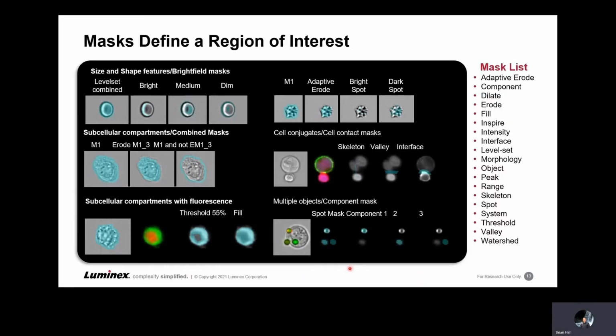The next step is to look at nuclear localization, and to introduce that subject, I need to bring up something called a mask. A mask is how the computer identifies a region of interest and tells the algorithm where to look for different fluorescence intensities. In this example, here's a mask that masks the entire cell, which would tell me the overall cell size.